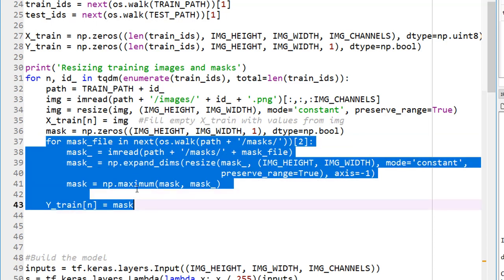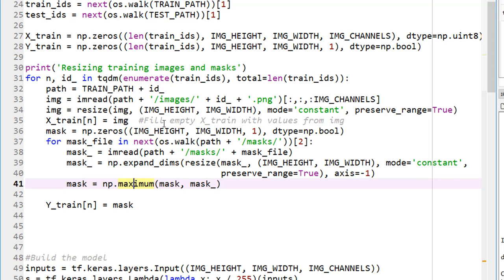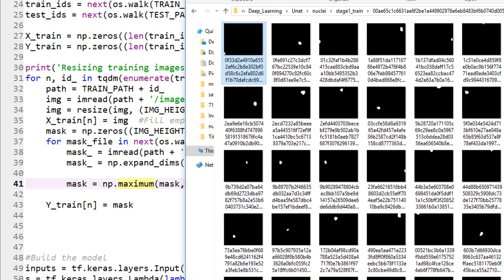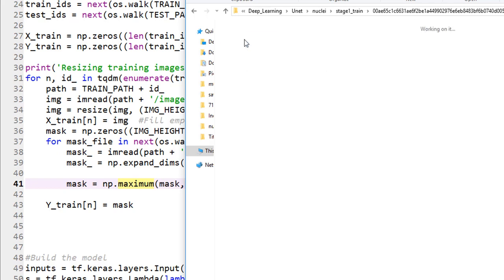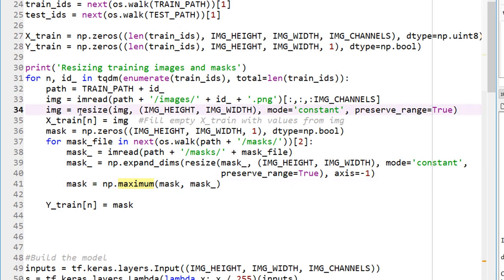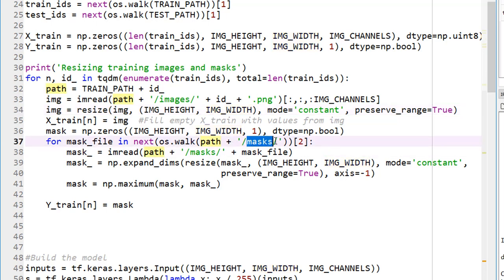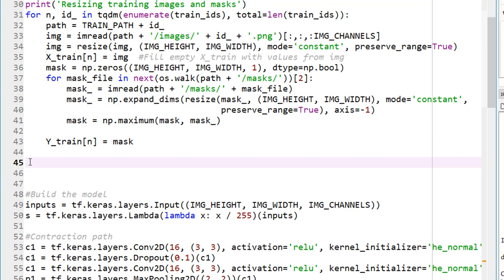Please go ahead and write the code, execute it, and try to understand exactly what's going on. We are walking through each subfolder within stage_1_train, opening the images folder, and resizing the image to 128 by 128. Then opening each mask image and taking the maximum pixel value at each pixel location from those masks.